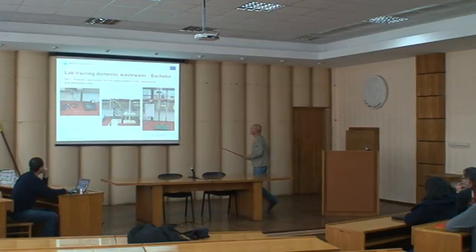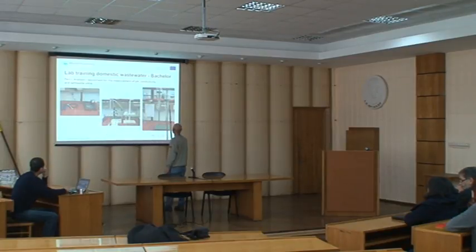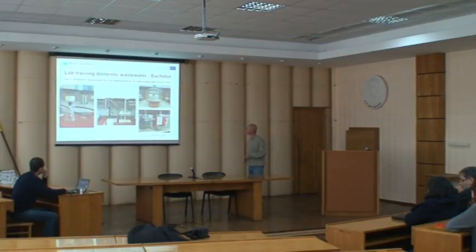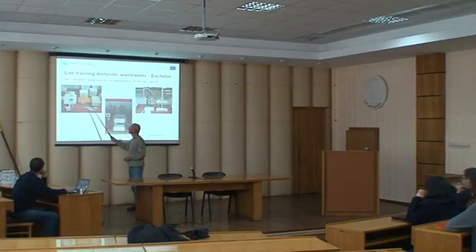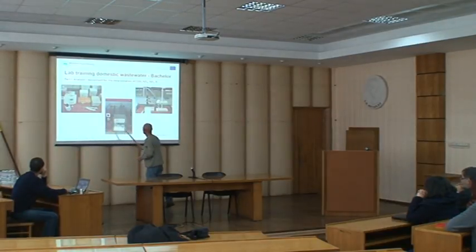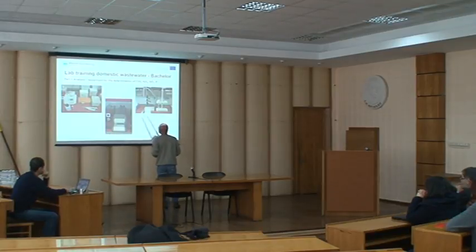So this is the equipment being used. These are only examples: the pH measurement, the turbidimeter, these units for the filtration and the settleable solids. These units are being used for the determination of, for example, COD, nitrate, nitrite, ammonia, and other parameters.